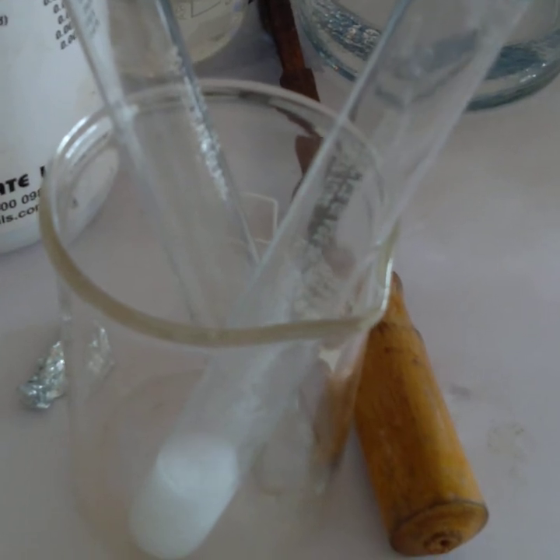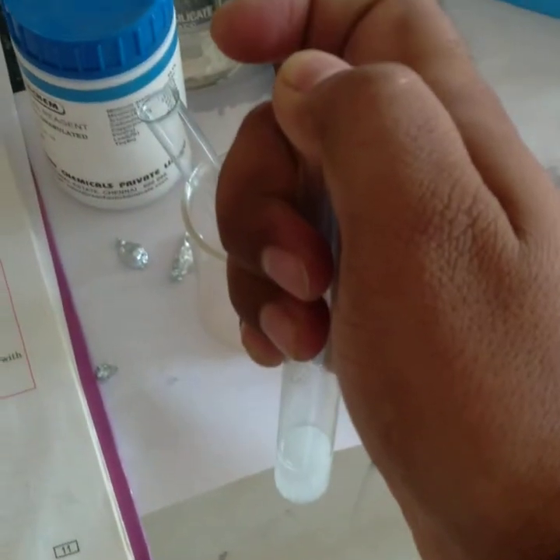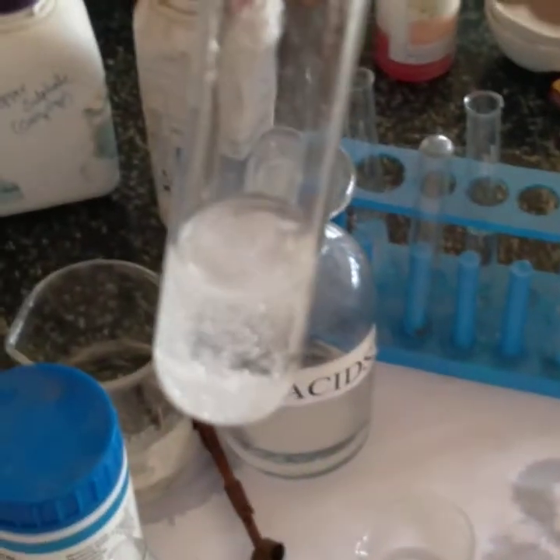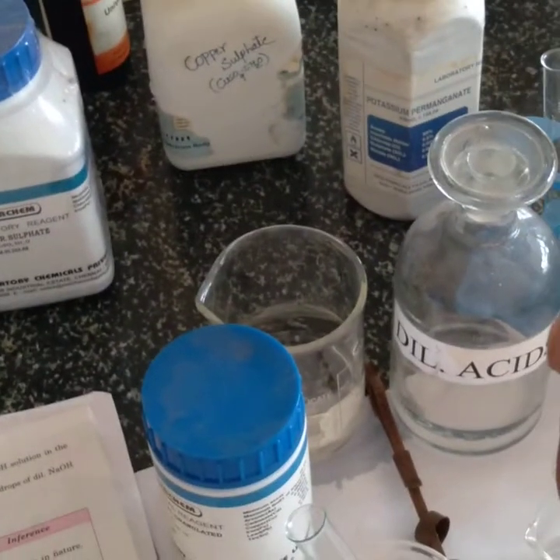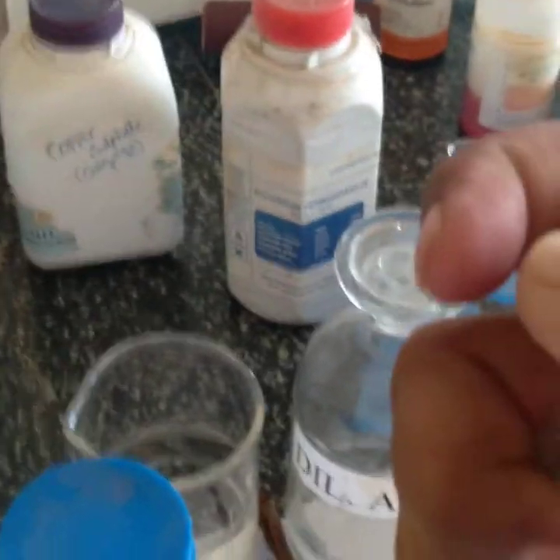See, brisk effervescence is coming out of this test tube. So I have to hold the gases which are coming out of the test tube. Now I am going to pass this CO2 gas. Look, see how the bubbles are coming below. Okay, I am going to pass this CO2 gas to the test tube that has lime water inside. Then what happens? CO2 reacts with lime water and is converted into calcium carbonate. Now I am going to pass it.